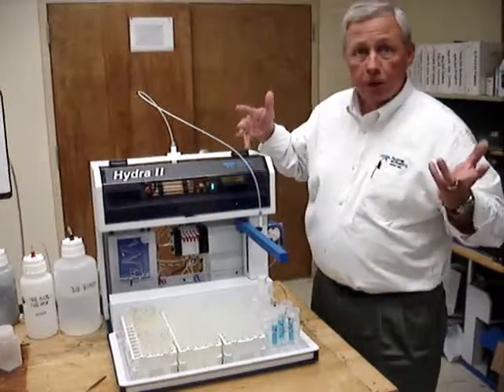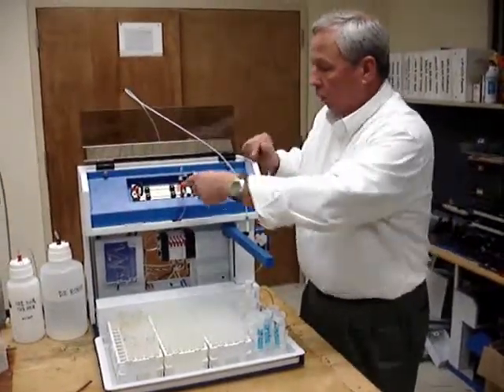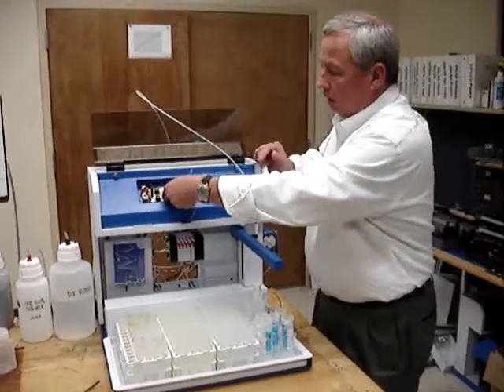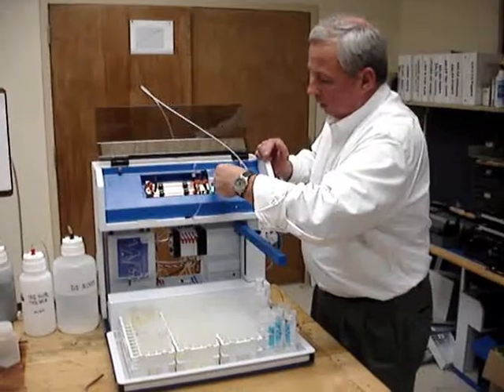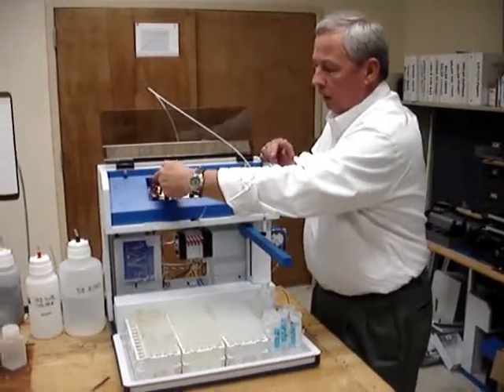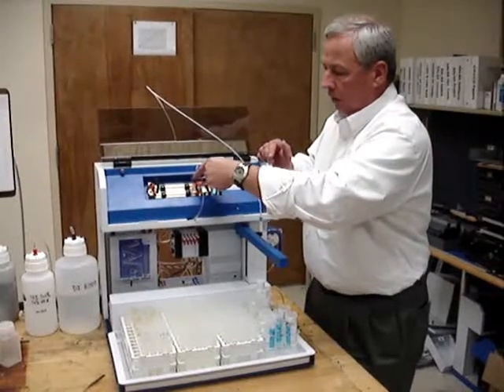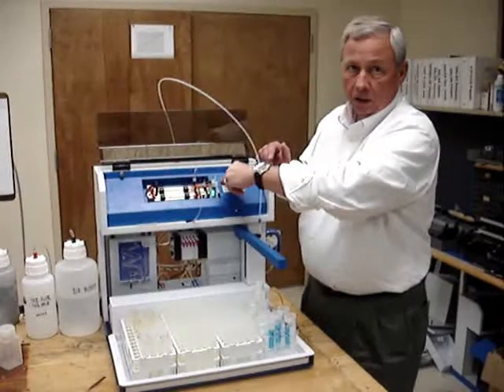Here's a quick overview of the Hydra 2. It has a three-component optical cell. Optical cells are easily removed for clean replacement. Light from the lamp passes through the optical cell, off a mirror, off a mirror, back through the optical cell, through a short cell located back here and into the detector.